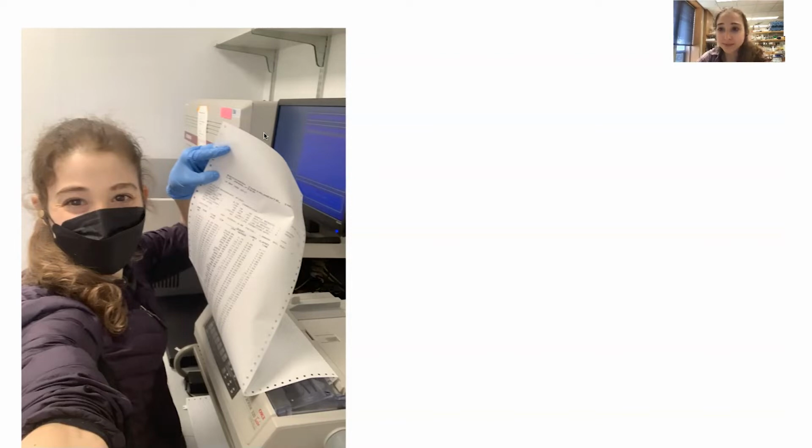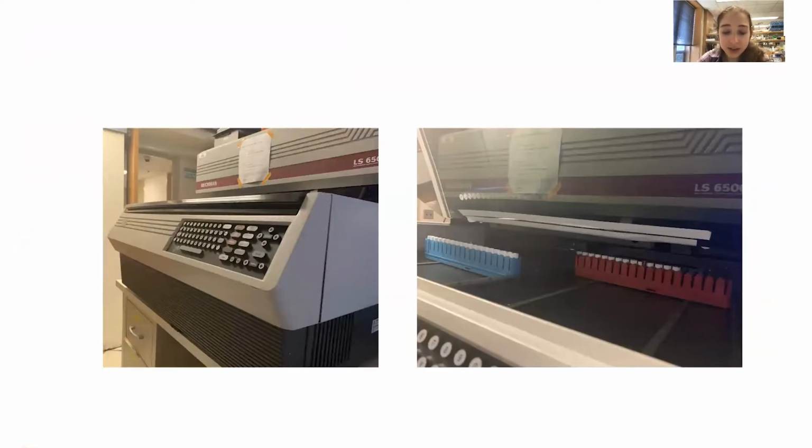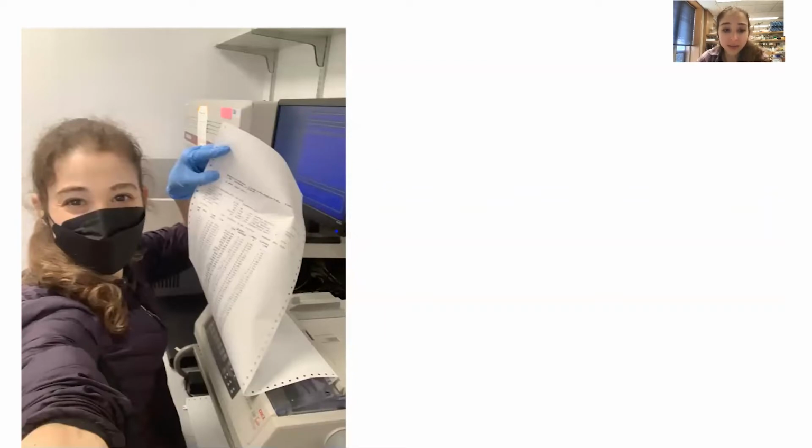I feel like in science, equipment either lasts forever without ever having an issue, or it works for 2 days and then breaks, and then works for 2 days and then breaks, or then it goes obsolete. But sometimes equipment like this is just very, very durable. And so this machine might look really old, but it is still really, really powerful and useful.